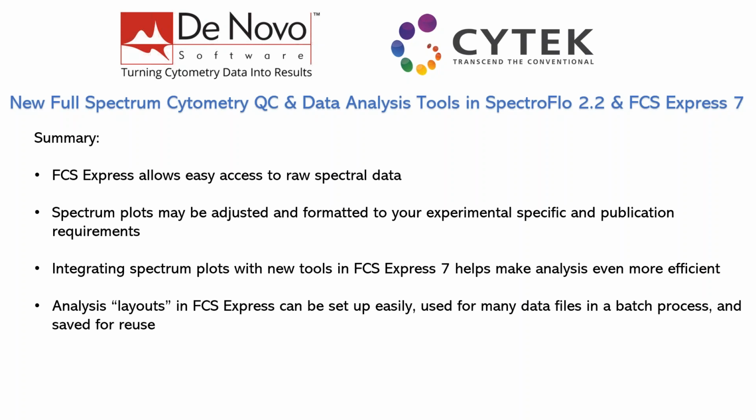Integrating the spectrum plots with new tools in FCS Express can help make analysis even more efficient. That also goes for integrating any of the quality control tools that you might be used to using in SpectroFlo. You can take a lot of what you've learned there. You can create some panels, some layouts in FCS Express to help you easily compare side by side. You can do that for many different data files, in a batch process, with multicolor controls versus single stain, for cells versus beads. Really, in the end, it's up to you, whatever it is you may want to look at.